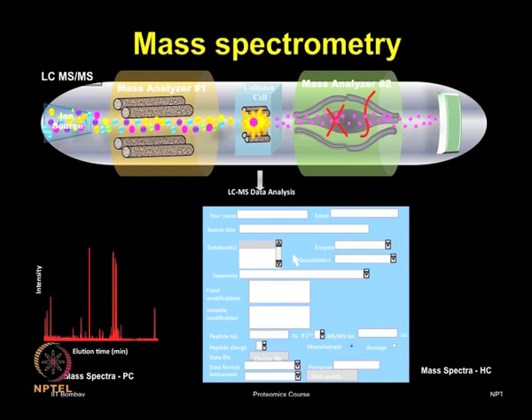Once the spots are analyzed and excised from the gels, then you have to follow the same tradition. You can use any of the mass spectrometry platforms and then obtain the MS spectra for further analysis using different types of bioinformatic tools such as Mascot.